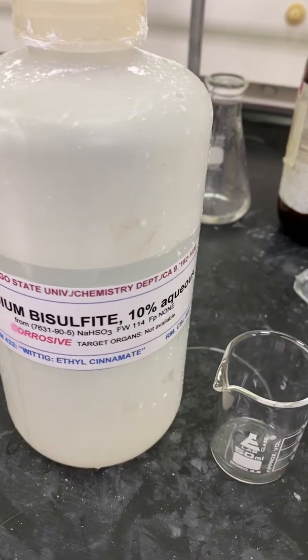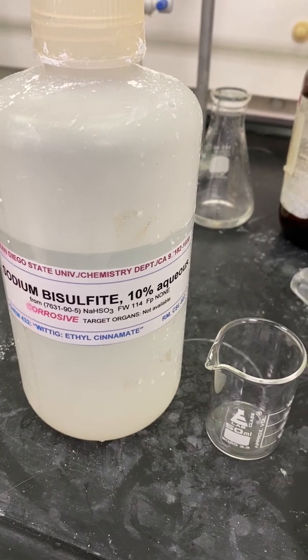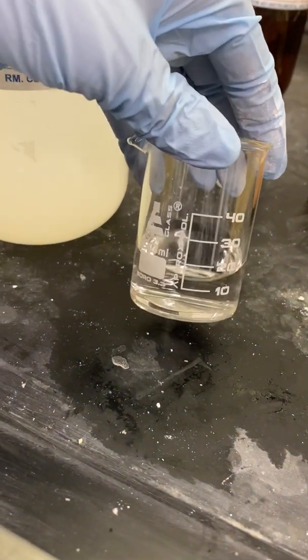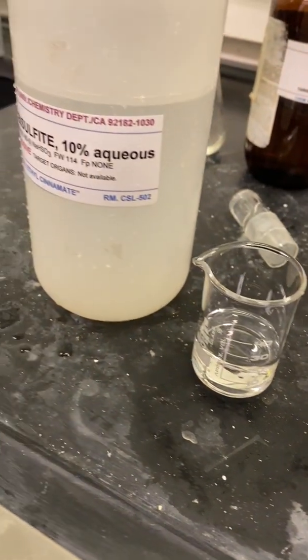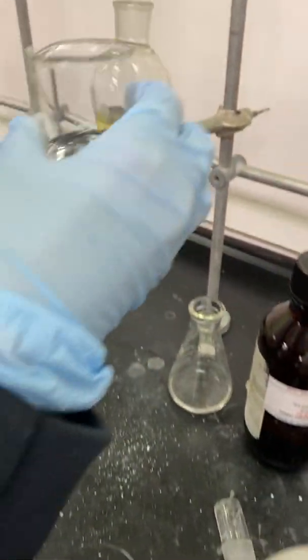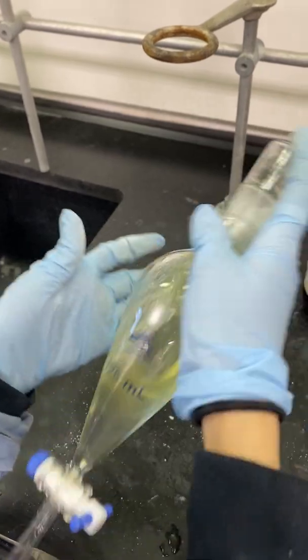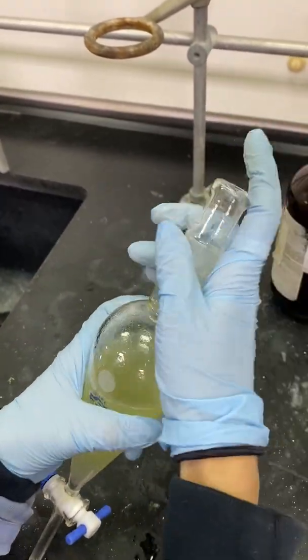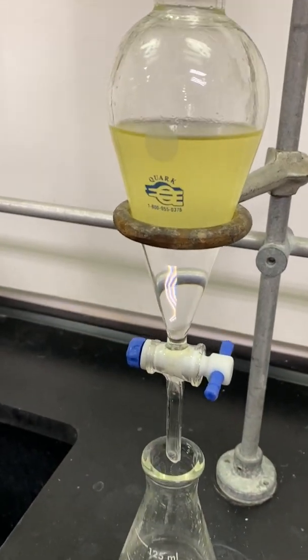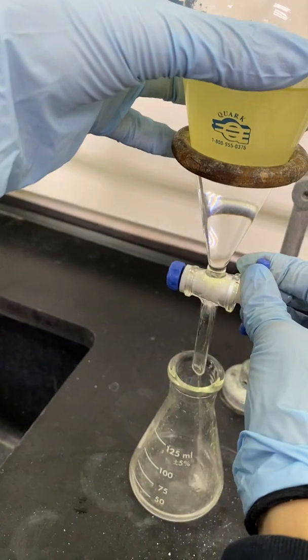I will now measure out about 20 milliliters of 10% aqueous sodium bisulfite. This will react with any remaining excess aldehyde and transfer it to the aqueous layer so it can be extracted. I will add the 20 milliliters into my separatory funnel containing my product, then shake and vent the separatory funnel for a total of three times before draining the aqueous layer into the same 125 milliliter Erlenmeyer flask I previously used.